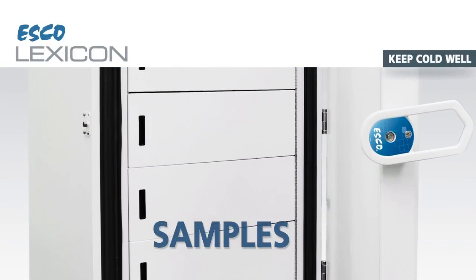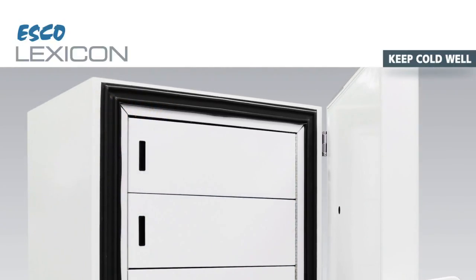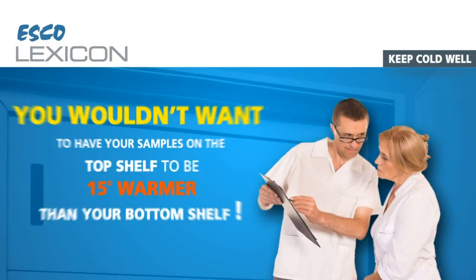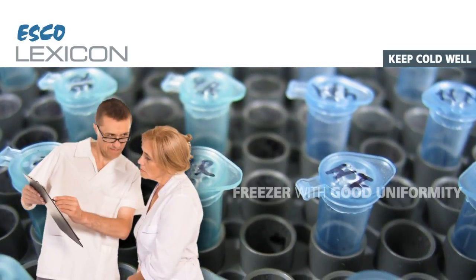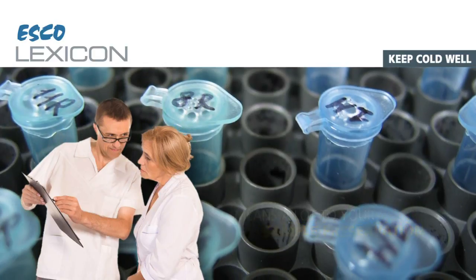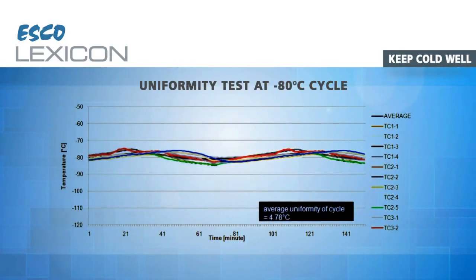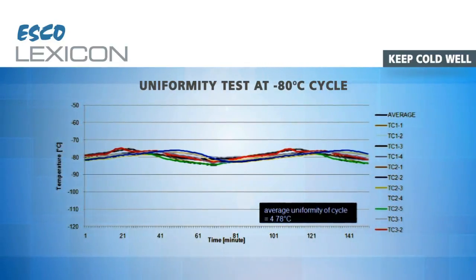Samples stored in all corners are equally cold. You wouldn't want your samples on the top shelf to be 15 degrees warmer than those on the bottom shelf. Looking out for a freezer with good uniformity could mean a lot to your sample preservation. A Lexicon freezer's uniformity profile should be like mine, with a difference of less than plus or minus 3 degrees from the set temperature.